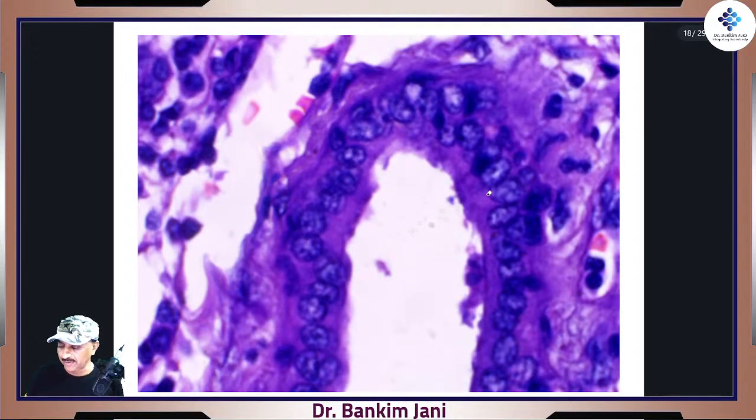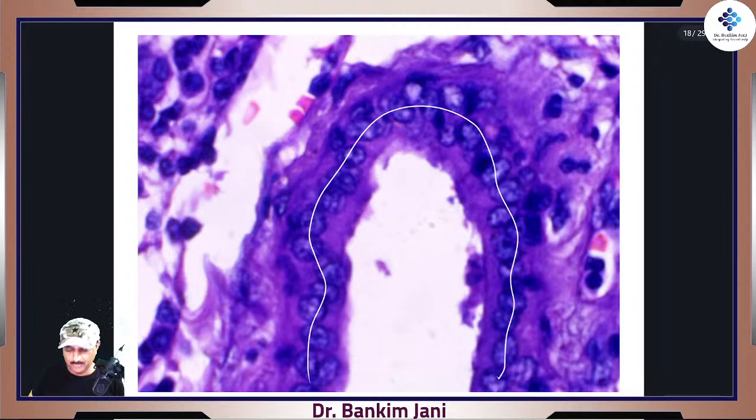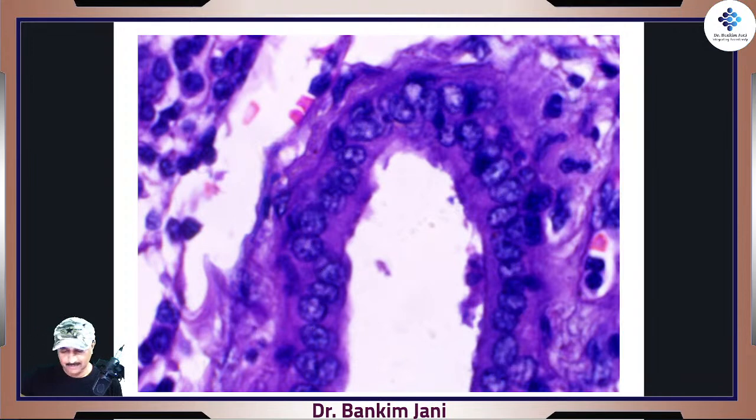This is the parotid duct. This parotid duct, right? A single layer of extraordinarily beautiful cuboidal cells. See, now they really look like superb precious stones.